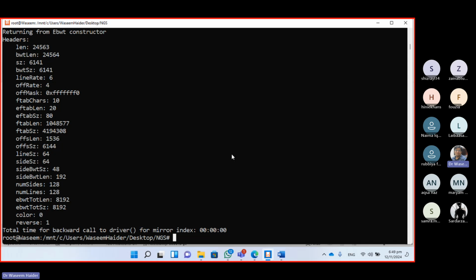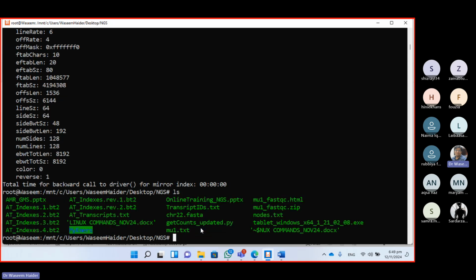They are placed properly in a library. So here the problem is that you can take a short read and match it into multiple places, and you can do that against all sequences, but that's going to take really long. So what happens is you make their indexes. They are there in machine language.